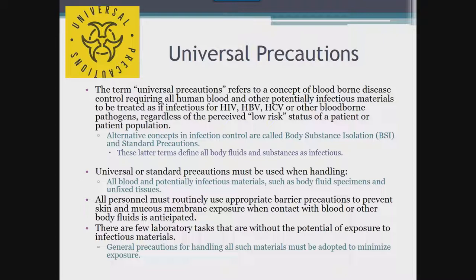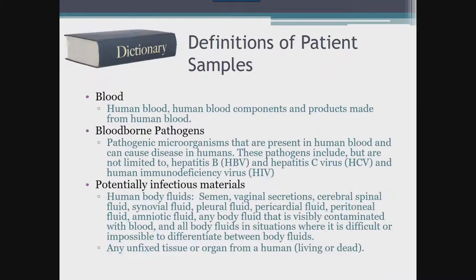You may also hear the terms body substance isolation or standard precautions. These terms define all body fluids and substances as infectious. This makes sense — in our world of safety, you never really know the infectious status of a patient. When you treat every patient as infectious, you have reduced your risk of exposure by handling every specimen with the appropriate protective equipment and engineering controls. Universal precautions, body substance isolation, and standard precautions refer to many terms within their definitions that we need to define so we are consistent in how we apply these processes.